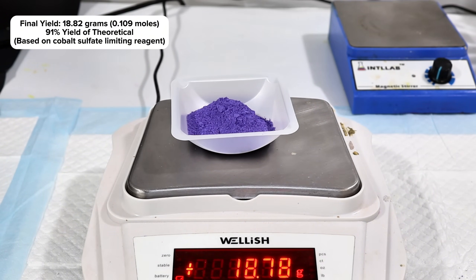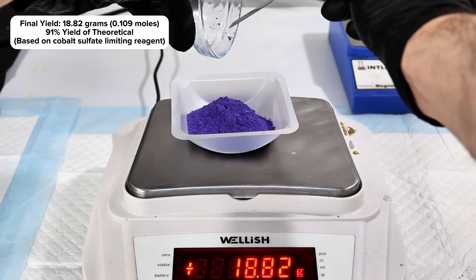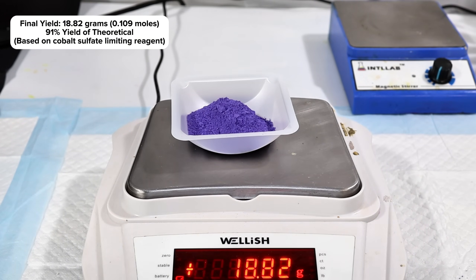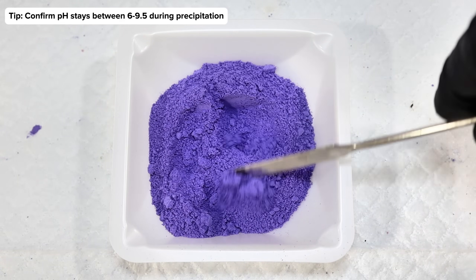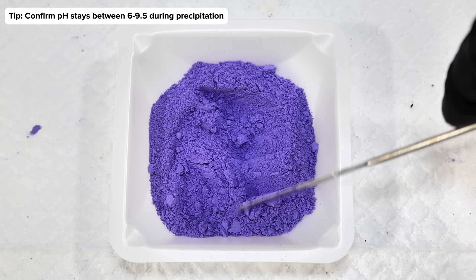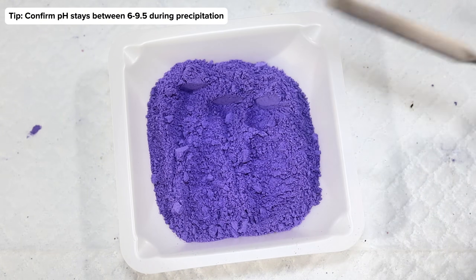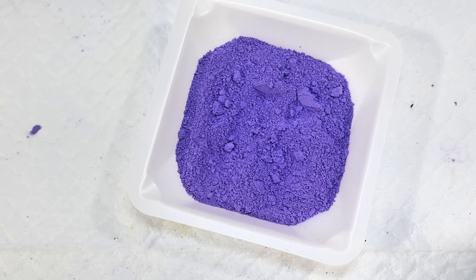As a quick side note, I've never really been able to get this particular reaction above around 85–90% yield, and I'm honestly not certain how to get it higher. Making sure the pH stays above 8 and below 12 by adding a little extra ammonia during the precipitation step seems to be the most important factor in maximizing yield.